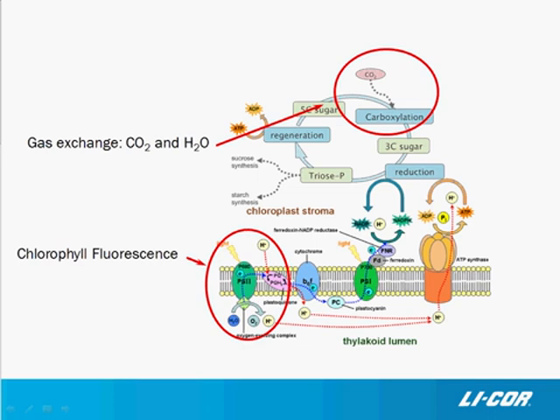We can do this in two main ways. We can look at gas exchange, or we can look at chlorophyll fluorescence. This webinar will only discuss techniques that use gas exchange. But if you're interested in chlorophyll fluorescence, we have several webinars that discuss it, and I encourage you to watch some or all of them.